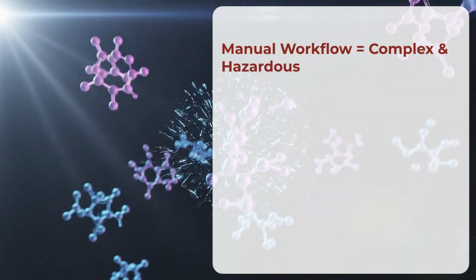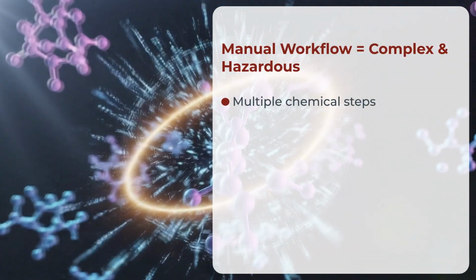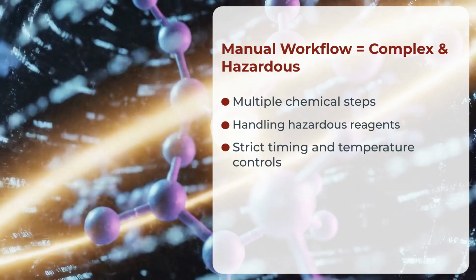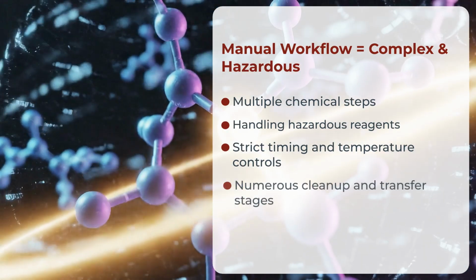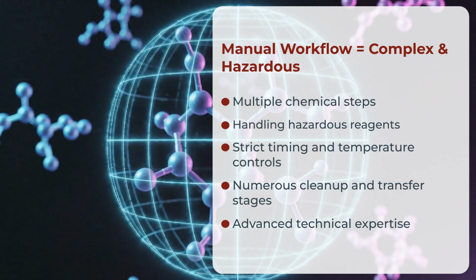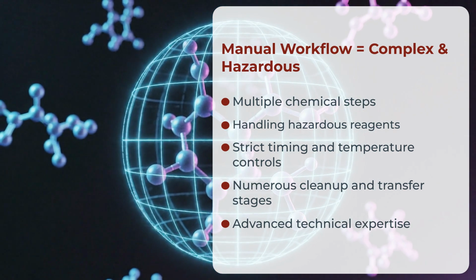Traditionally, MOSH-MOAH testing requires multiple chemical steps, the handling of hazardous reagents, strict timing and temperature controls, numerous cleanup and transfer stages, and advanced technical expertise. Because of these challenges, more labs are turning to automation.